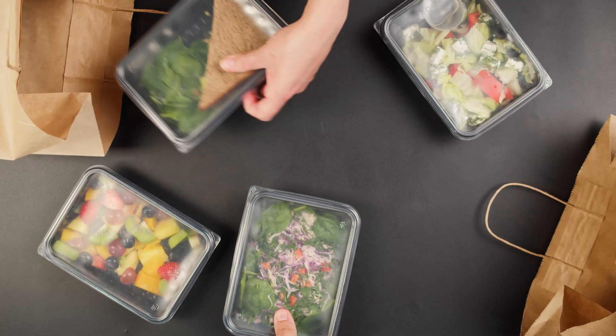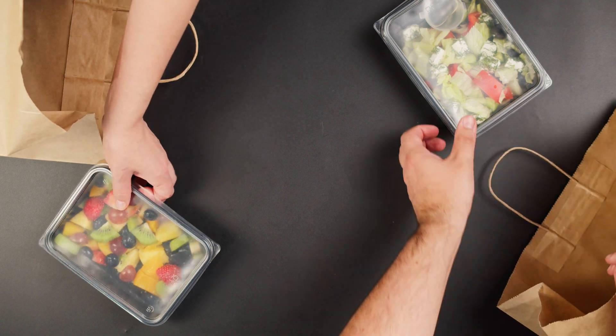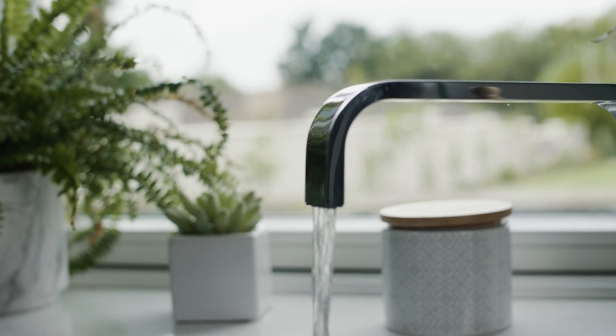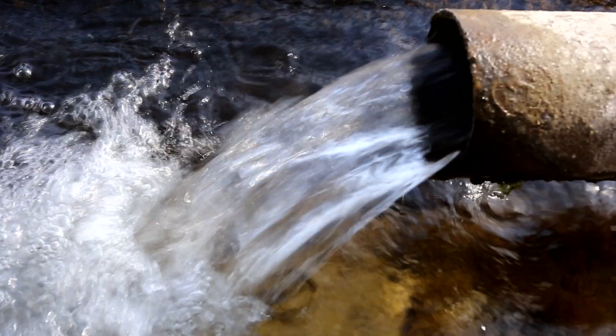Use nitrile gloves rather than latex. 5. Keep food, especially wrappers, away from the sample area. Avoid contact with these products before you start sampling. 6. It's recommended that you follow all normal drinking water sampling guidelines. For instance, it is much easier to sample from a tap rather than using pumps and balers.